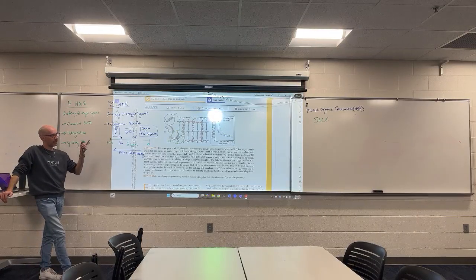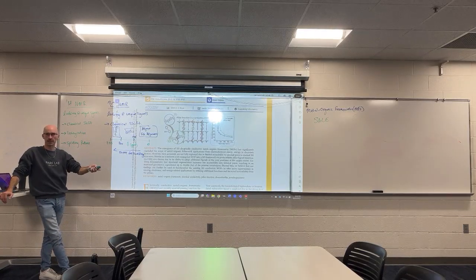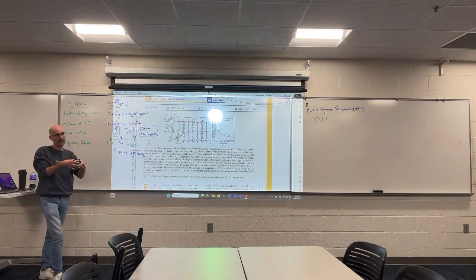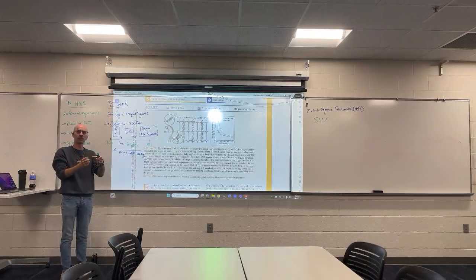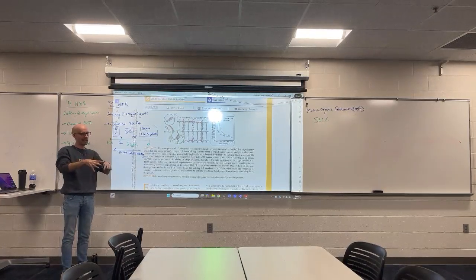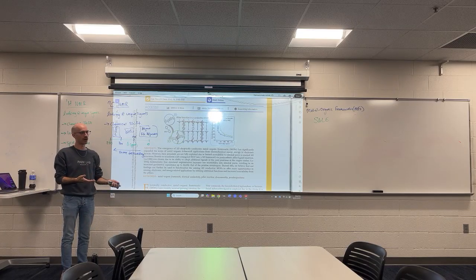In Dr. Mondlock's lab, we were looking to exchange those organic linkers for different organic linkers. So my job was to take a material called ZIF8, and I would put in a different organic molecule in an organic solvent, and I'd mix it around, and then I'd isolate the MOF again, and to see how much of the new linker I had put in, I would digest the MOF and put it into the NMR.